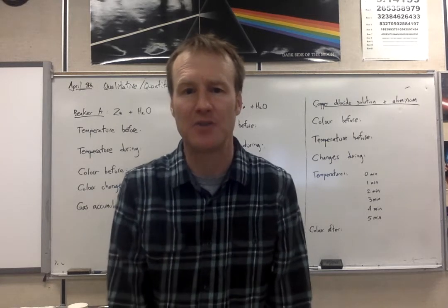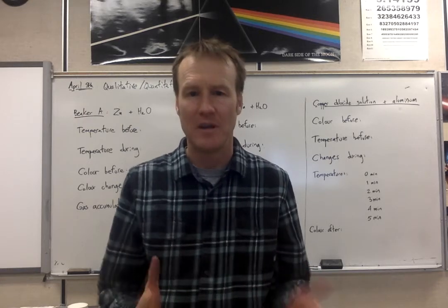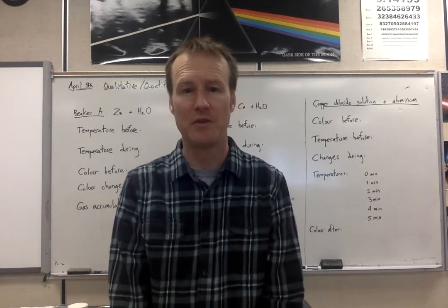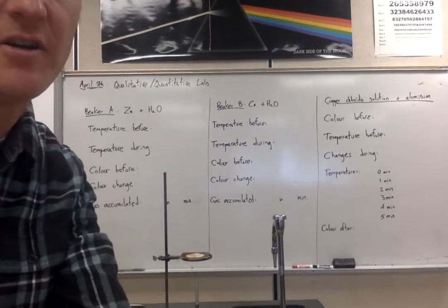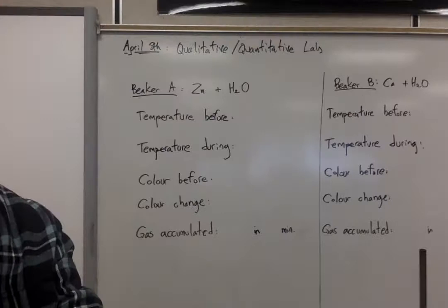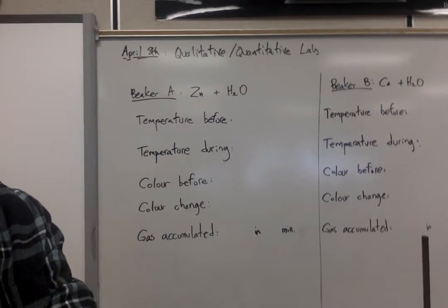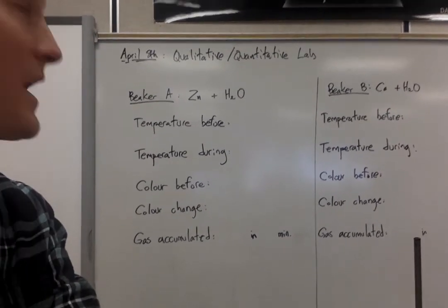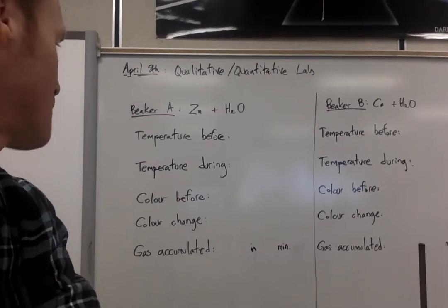Of course, I'm going to expect you to read the lab and see what I did, see the procedures, but here are the observations that I would have us write on the board if I was doing this with you as a class. In part A, I'm going to be interested in what's the temperature before I start the reaction, or before I add the things that can react or might react. What is the temperature during that reaction? Maybe what's the peak temperature, the highest one?